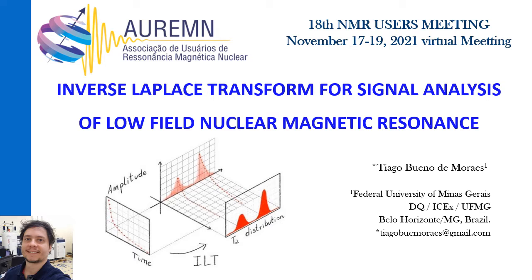And in this poster, I will talk about inverse Laplace transform for signal analysis of low field nuclear magnetic resonance.